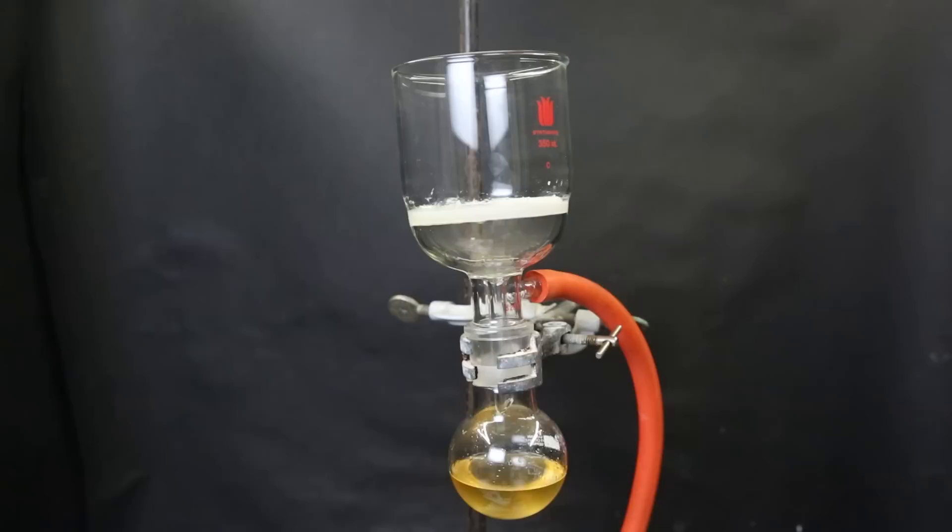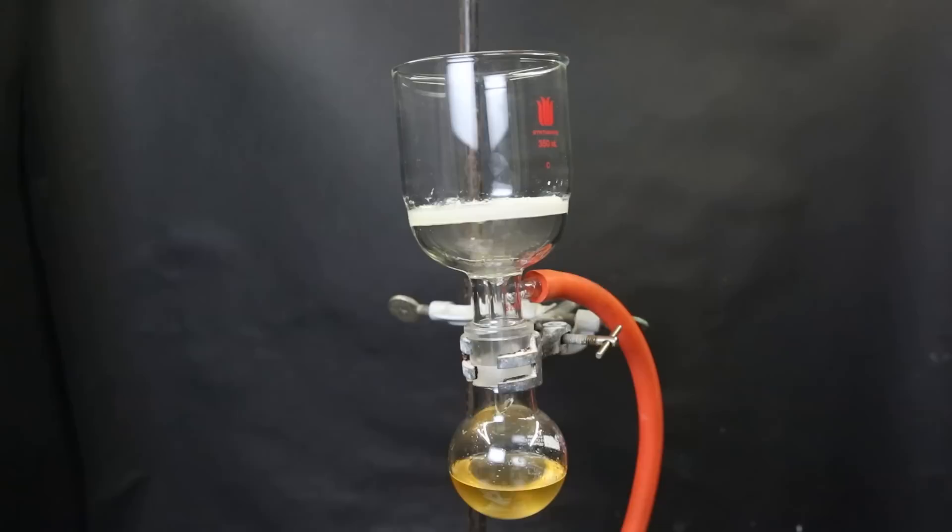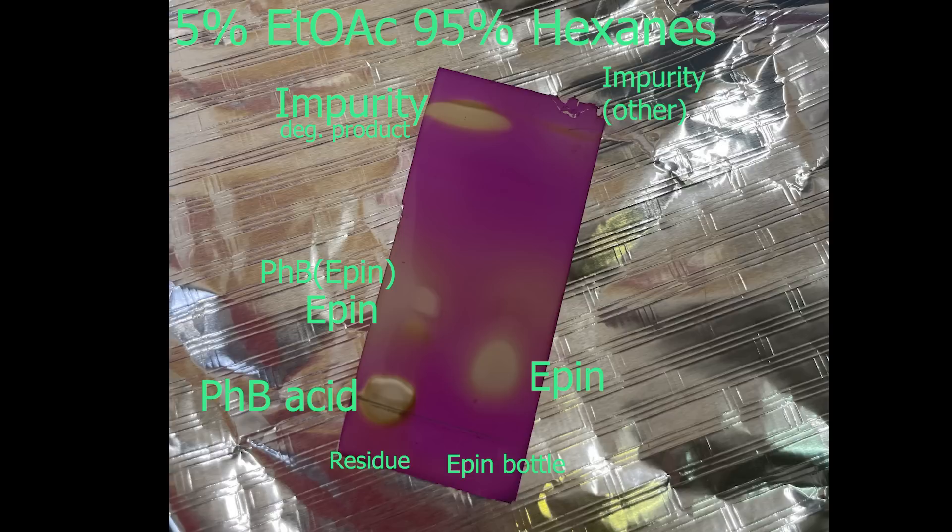I then collect some of the residue and test it with TLC to see what it is. At first, I thought it was epin, but the TLC tells us that it is mostly phenylboronic acid. On the left is a residue that I collected, and on the right the pure epin that I made. We see that the spot that corresponds with epin is actually very small on the left. Since the solid wasn't dry and trapped some of the liquid, we of course also expect to see all of the other compounds of that liquid in the TLC. The thing is that the phenylboronic acid has a huge spot on the left, which is not the case when normally testing the liquid. This tells us that the solid is mostly phenylboronic acid that crystallized out. We also see a very large spot at the top, which is the degradation product of phenylboronic acid again. Now that I have a better idea of the components of my mixture, I can start separating them.